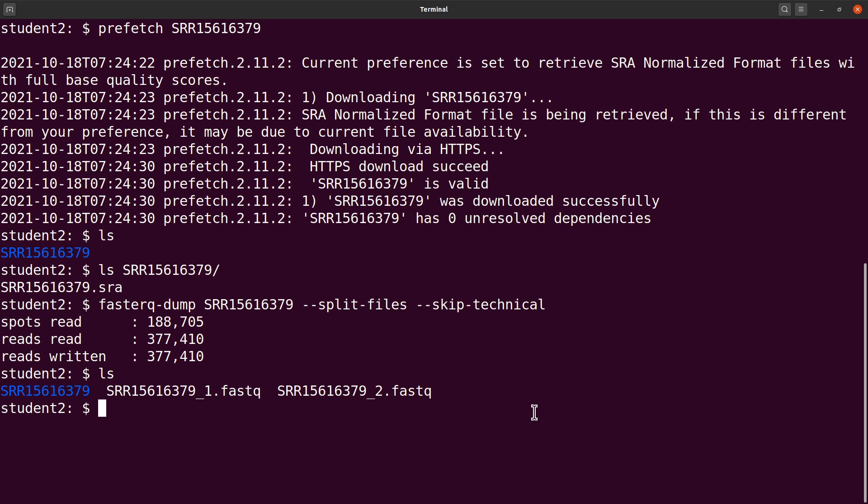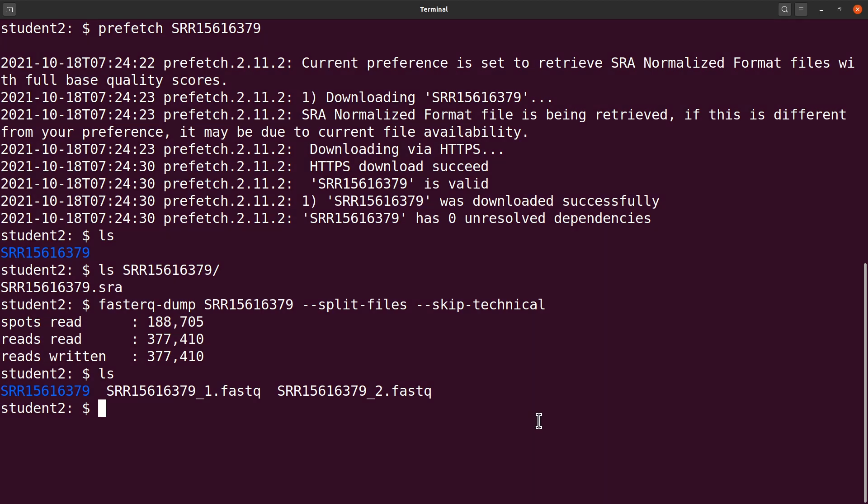There are a number of tricks you can also use to make your SRA toolkit extraction faster, but these things will be covered in later tutorials. So once you have your FASTQ files extracted, you can choose to remove or delete the SRA files just to save some space.